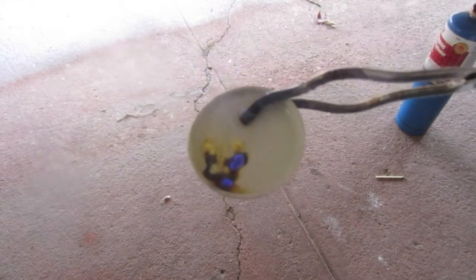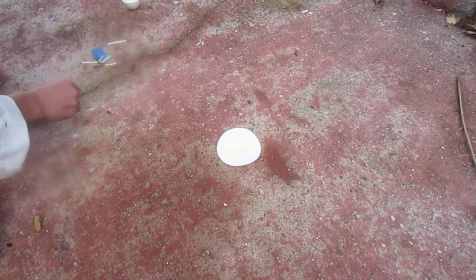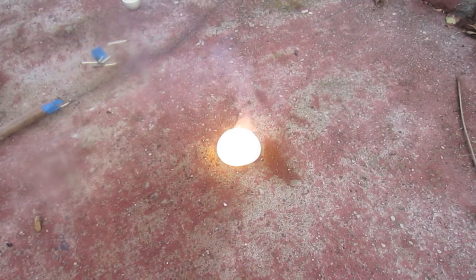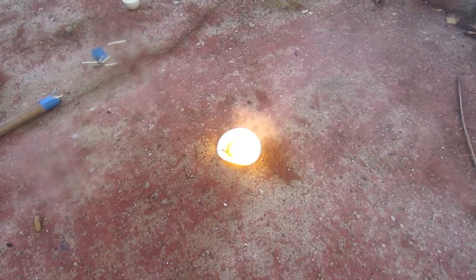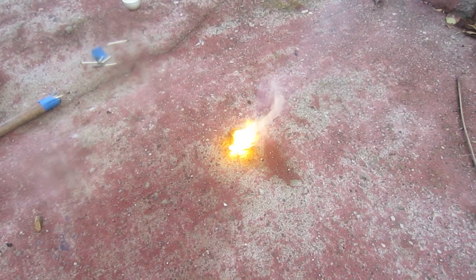You see that sulfur burns with a nice blue emission spectrum. Alright. Whoo, that's some sulfur dioxide.